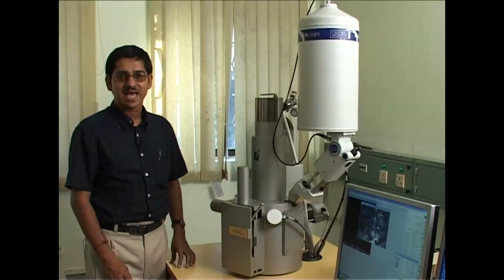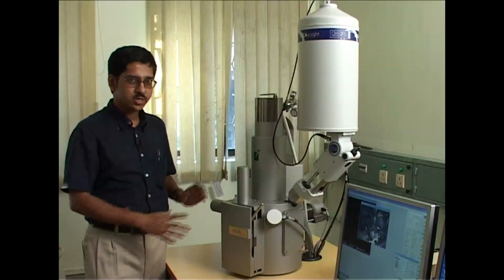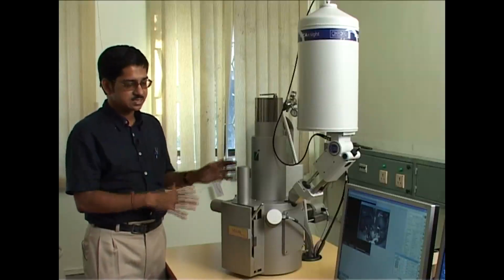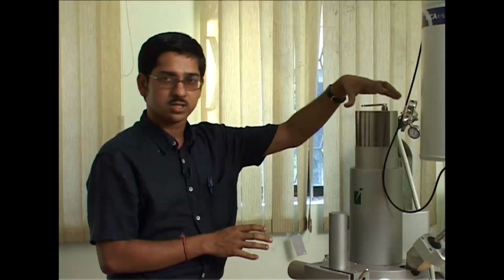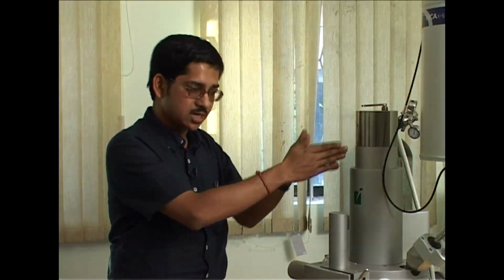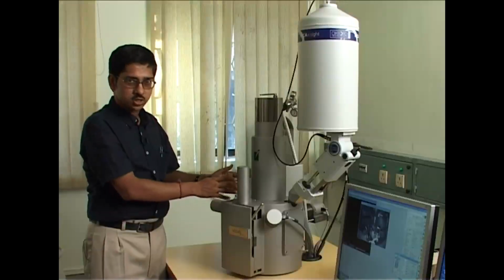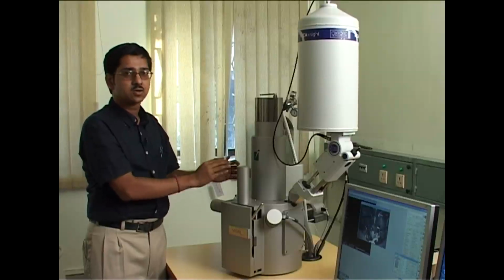Welcome to the Scanning Electron Microscopic Facility of CSIR, Indian Institute of Chemical Biology at Jadavpur, Kolkata. What you are looking at is a scanning electron microscope or SEM, and this is the Vega 2 LSU of Tescan. The most important part of the microscope is the electron gun or the source of the electrons. So, electrons come out from this with a definite accelerating voltage. They fall on the object or the specimen which is present on stubs, and these are coated with heavy metal.